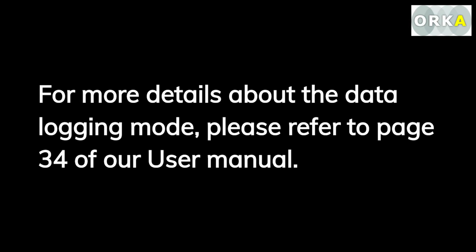For more details about the data logging mode, please refer to page 34 of our user manual.